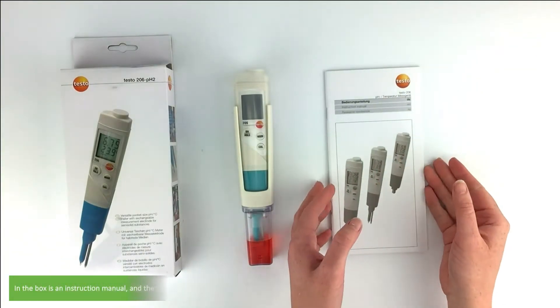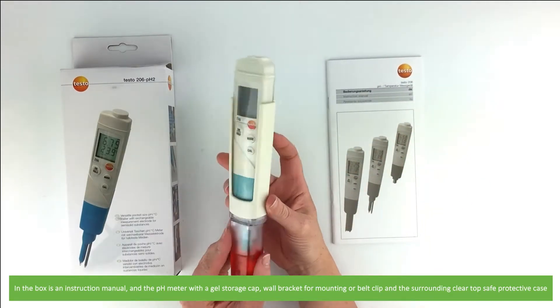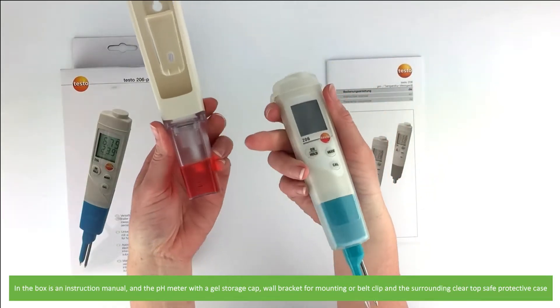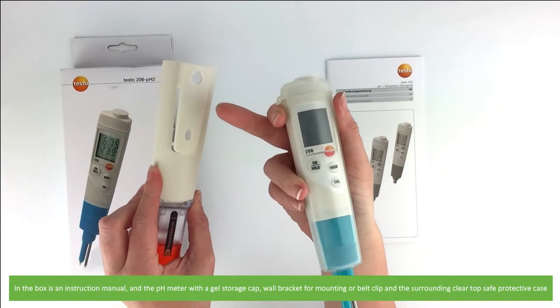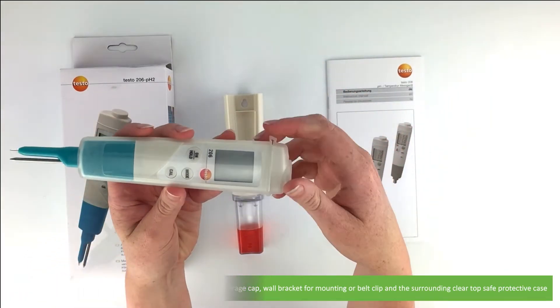In the box is an instruction manual, the pH meter with a gel storage cap, a wall bracket for mounting or a belt clip, and the surrounding clear top safe protective case.